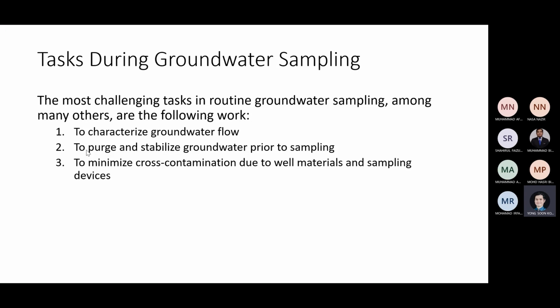You see, bacteria, they're very stubborn. They can form biofilm from anywhere. So the water tube may have it, and flushing it is a good idea. Of course, not just the tube, but the pump. You see, the tube, unless you buy it new, and even if you buy it new, there might be a source of contaminants from a new tube. What about an old tube?